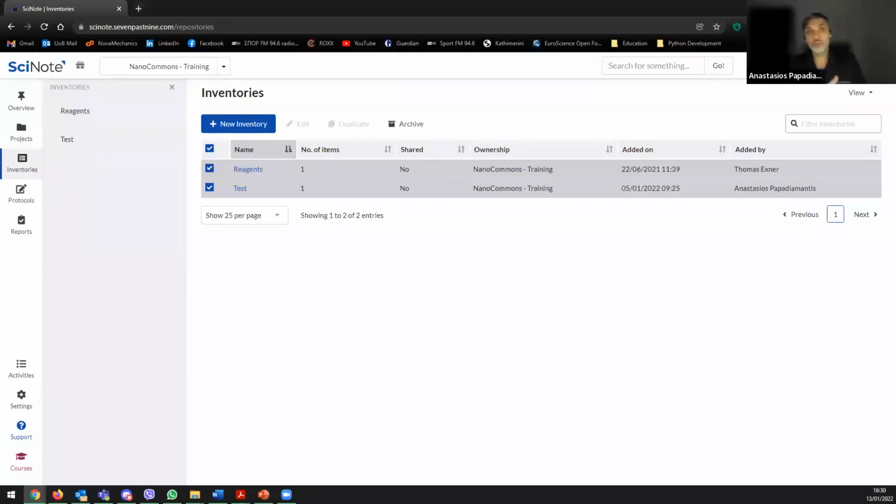So when it comes to privacy and the GDPR, this is more how it works. People that are not part of the team do not know that the team exists. So no one external is able to see anything that is within a team. There's no way that you can search for a specific team or a specific person and find them.